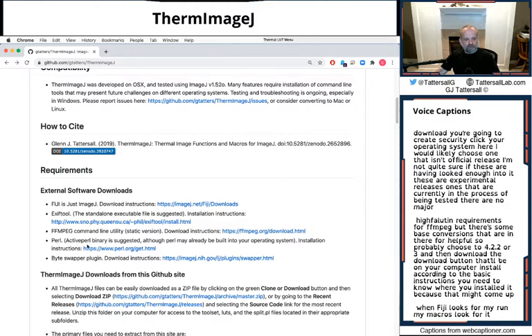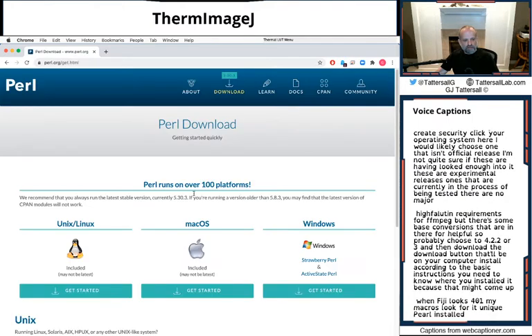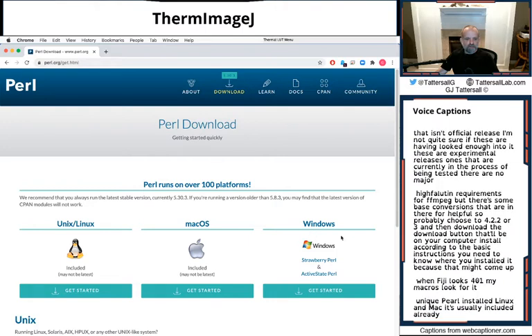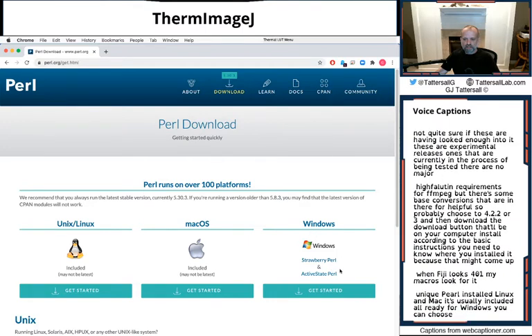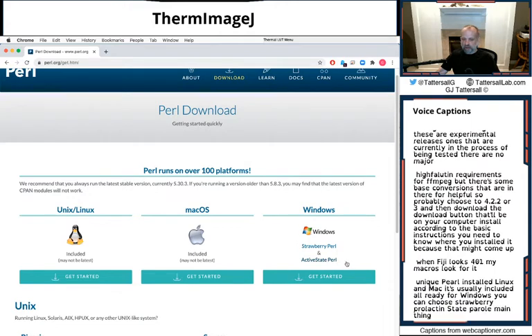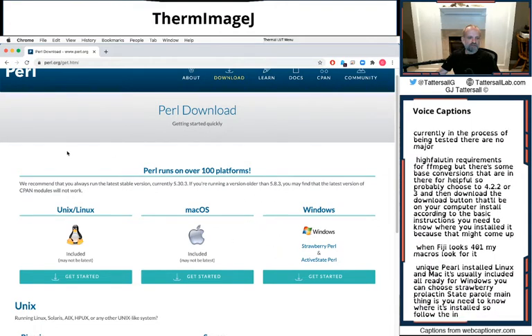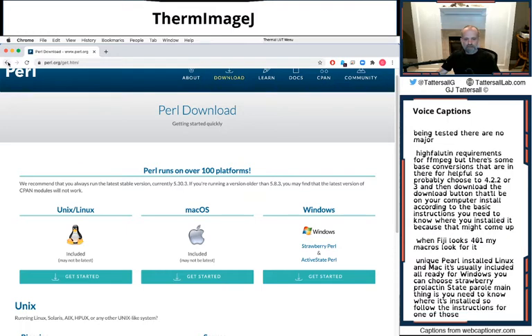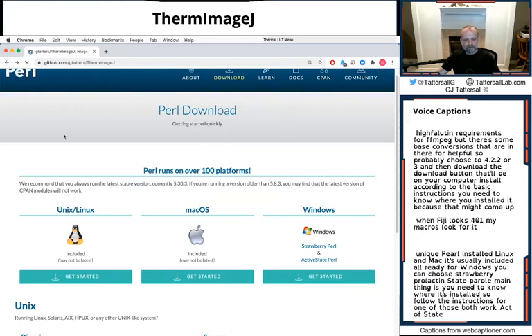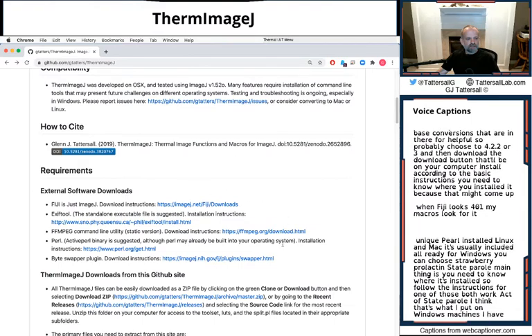You do need Perl installed. Luckily for Linux and Mac, it's usually included already. For Windows, you can choose the Strawberry Perl and Active State Perl. The main thing is you need to know where it's installed. So follow the instructions for one of those. Both work. Active State Perl I think is what I've put on Windows machines I have access to.